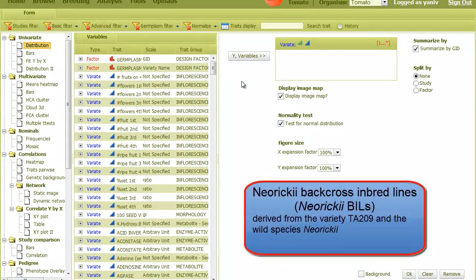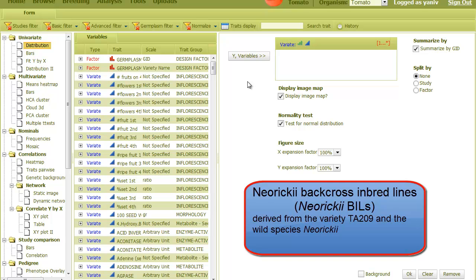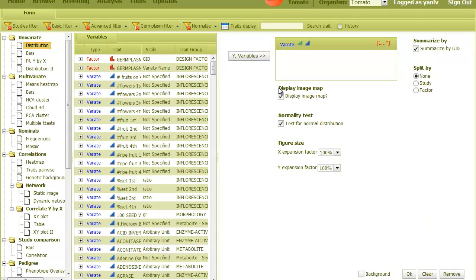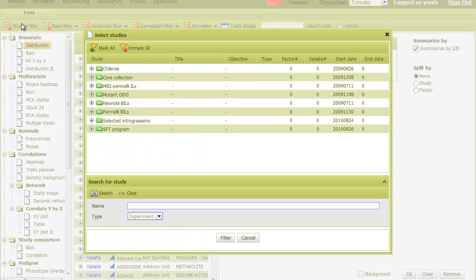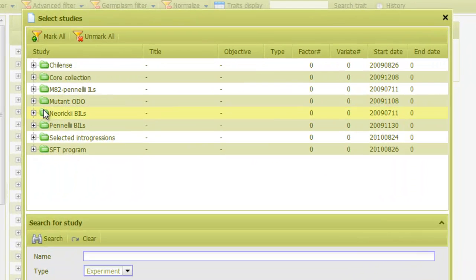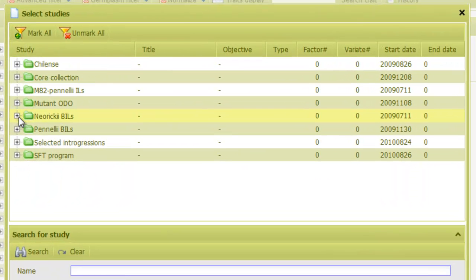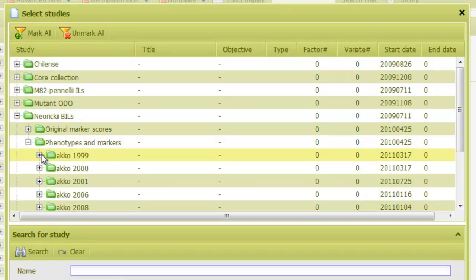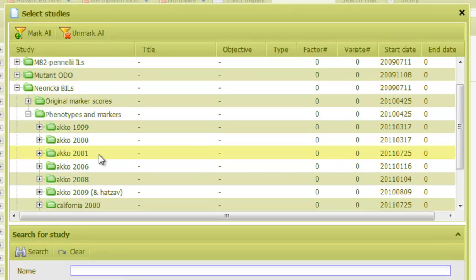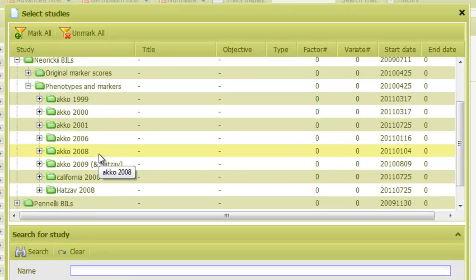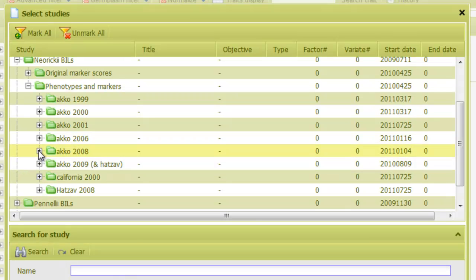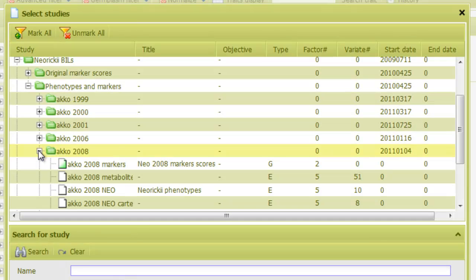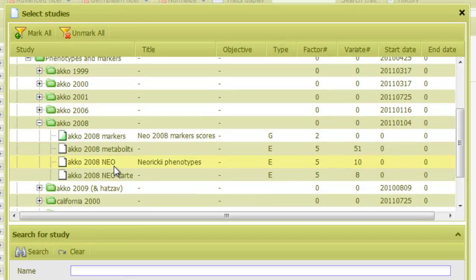Another mapping population that was extensively measured is the Neoreki backcross inbred lines. This population is derived from the variety TA-209 and the wild species Neoreki. To analyze it, I'll go to the Neoreki folder, select phenotypes and markers, and then enter one of the folders. Let's pick ACCO 2008.